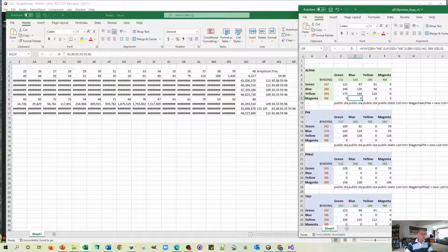And basically you can see there that what we've managed to produce are amplicons of 115 and 109, and 115 is the classic for green forward and reverse for the wild type, the alpha strain. And 109 is what you would get with the green primers if you had Phi or Phi A2.